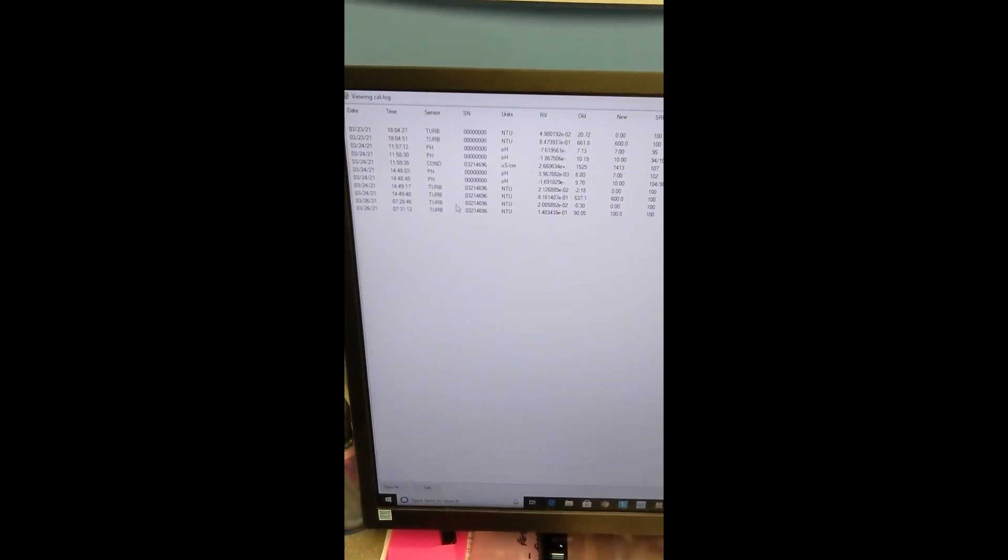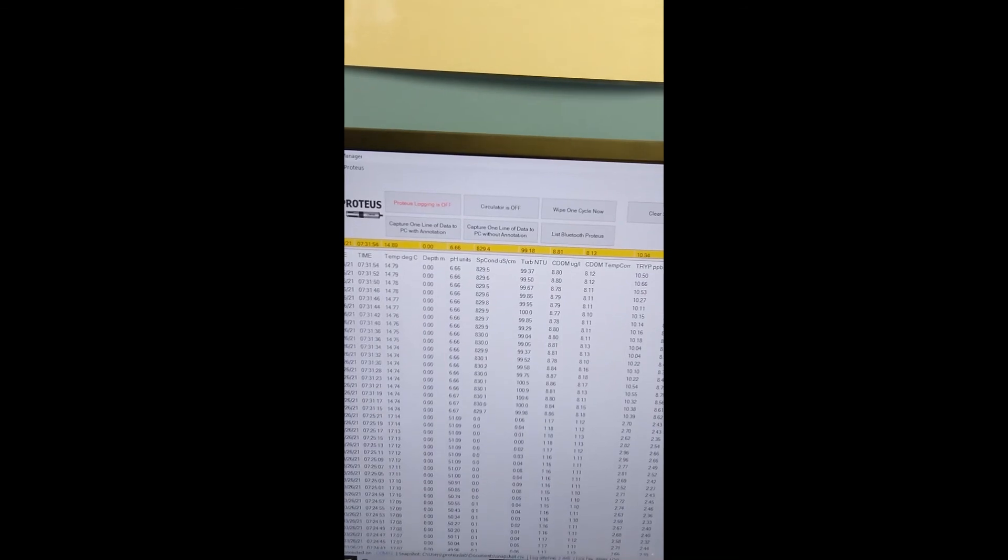I'll put that full screen. We can then see all the calibrations this unit has had before. You'll see there's the serial number of the turbidity sensor next to where it says what sensor it is. You've got the units that it's in, you've got what your old value was and the new value. Then you've got your SRF, which stands for sensor response factor. Closer to 100 it is, the better. This one is 100, perfectly good. And that is your turbidity sensor calibrated.